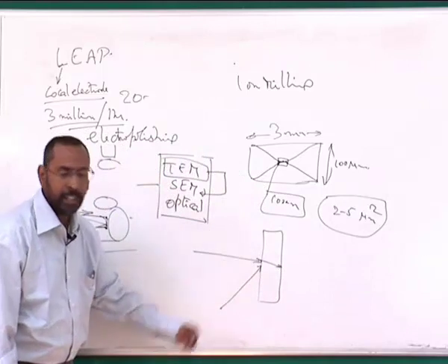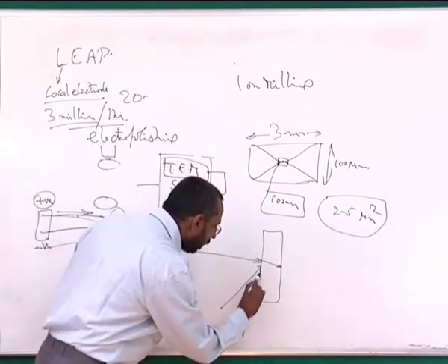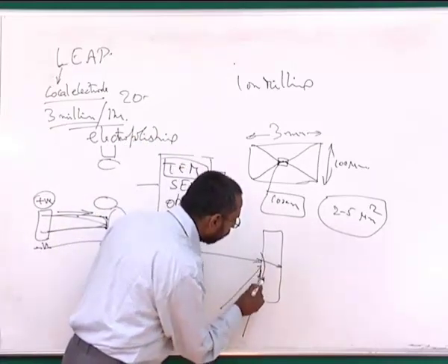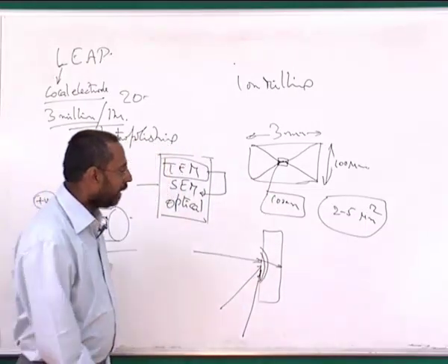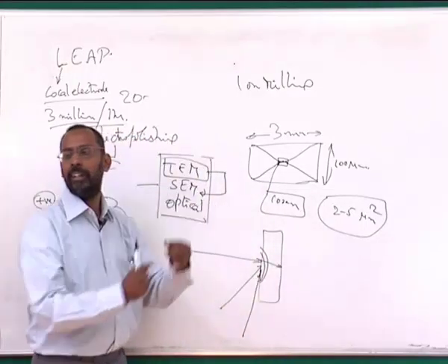So it will not thin the material. If an ion beam falls at a very glancing angle, it is actually removing the sample surface atoms. So it creates much shallower depths, and as a result, the larger regions will have thin regions.